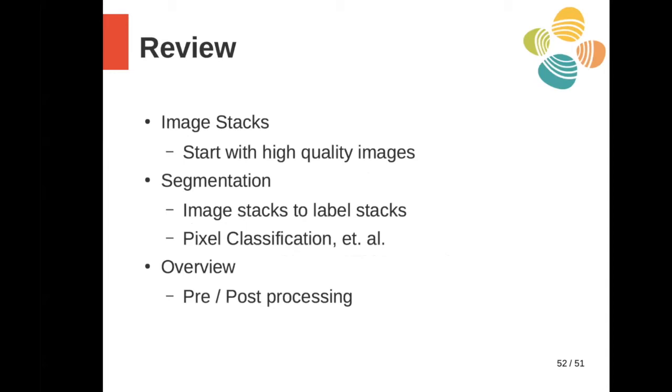Okay, so we've talked today about image stacks at a conceptual level. We've talked a bit about segmentation and different types of segmentation techniques, from thresholding to pixel classification. And we know that segmentation is how we turn the image stack into the label stack. And we've had just a little heads up about the pre and post processing aspects that are available once we have our label stack.